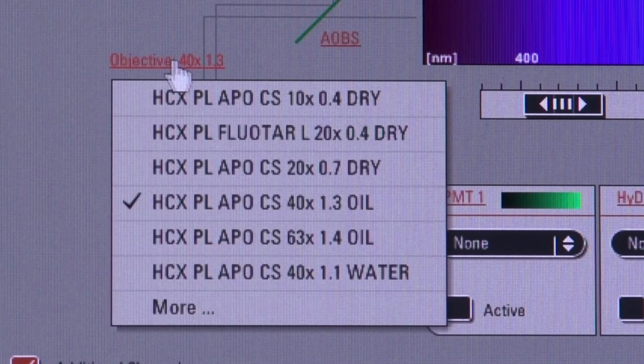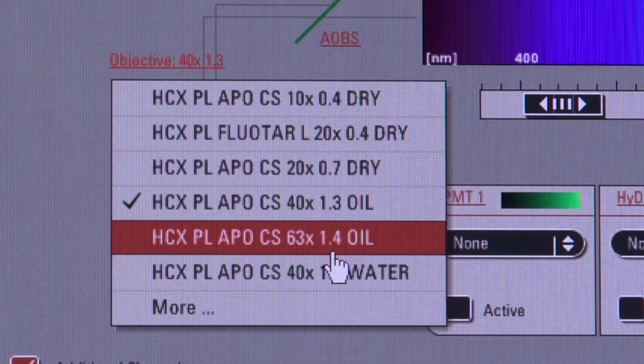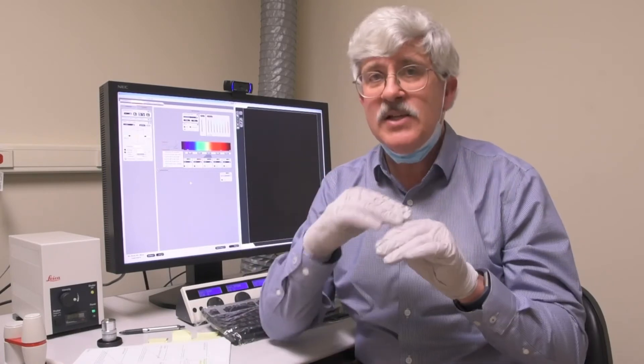As I have already mentioned though, we want to use the 63X objective. This has an NA of 1.4, so it has the highest resolution of all our objectives. Being a 1.4 NA lens, it is also an oil immersion lens. I am often asked why we don't have a 100X oil objective for this microscope, and the fact is we do. It is just not as good as our 63. The 63X and the 100X both have a numerical aperture of 1.4, so they both have the same resolving power and they can both see the same level of detail. The 63, however, gives us some advantages with confocal. With confocal, you are actually getting to your total magnification with zooming, and so you can start with a lower 63X and see a bigger field of view this way, more cells in there, and then zoom in to your final size.